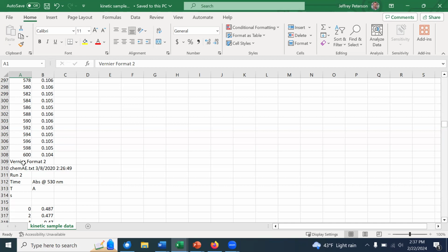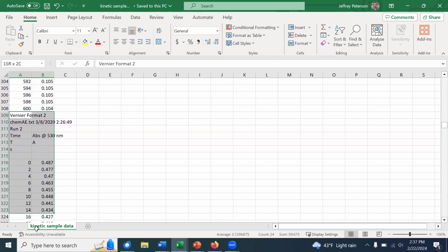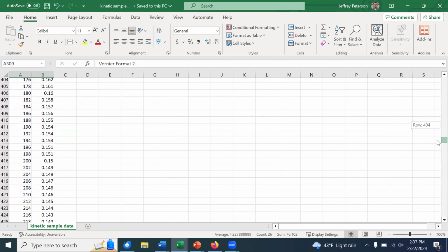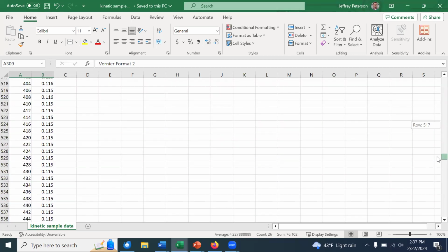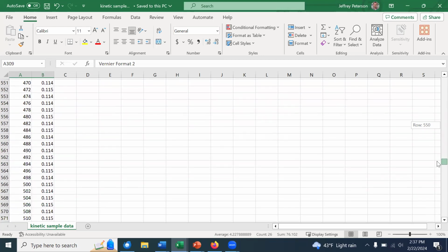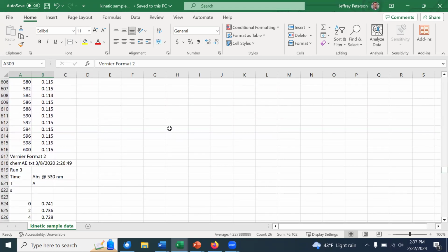First thing I'm going to do is reorganize my data. And so in order to do that, you can go through and copy paste or cut paste your data. You could imagine going through and sort of selecting all of it bit by bit, but I'm going to show you one quick trick. If you hold down Shift when you are using Excel, it will pick all values in between. So if you notice, I started by selecting some cells at the top of run 2. I'm now holding down Shift, and if I click this 600, it automatically picks all of them. Okay, so it'll save you some time.